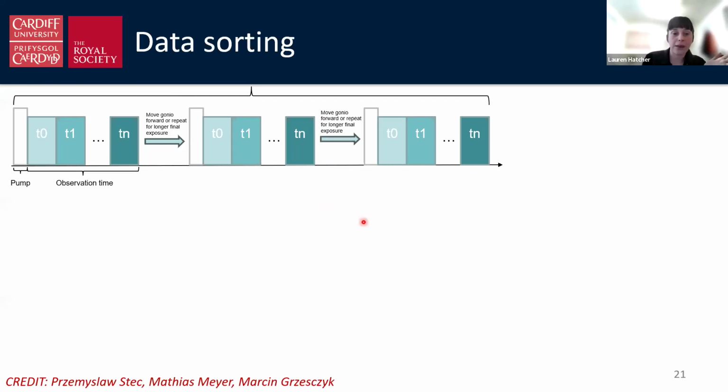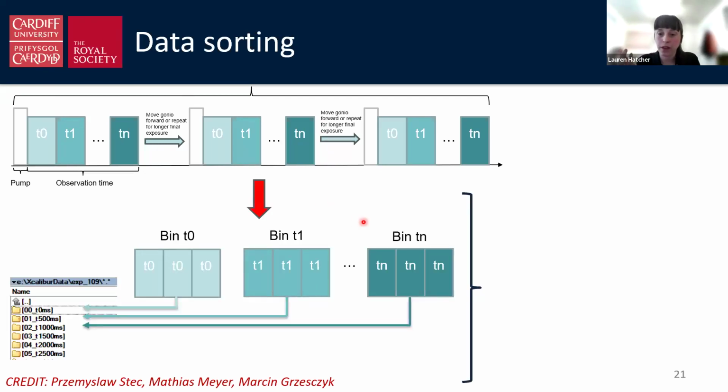And then each of those n buffers is then summed together, okay? And then they're dropped into their corresponding data collection folders as a frame. Yeah, so they sum up to be a 0.5 degree scan, and that's each frame, but they're already separated in buffers, and so they drop into each of the folders for each of the different time delays. So what we end up with is a set of standard crystallographic profiles for each data set at each time point that we've set at the beginning of the experiment. Okay, so that's essentially what I'm saying here.